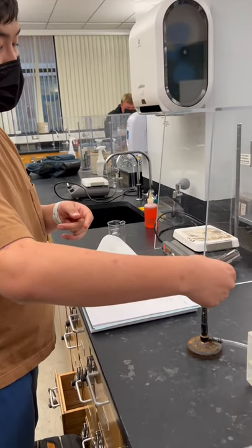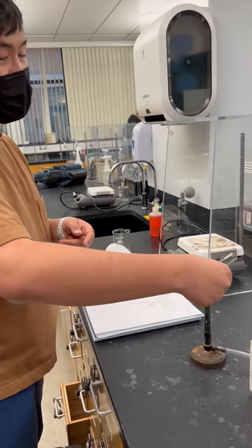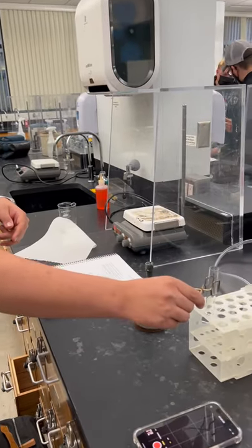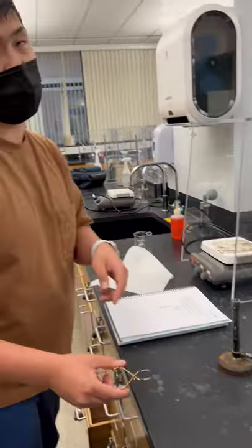Hold it at an angle, move it across the entire length of the tube — make sure you're not just heating up that one spot. Then take it off the Bunsen burner, and to cool it, put it in the test tube rack and let it cool.